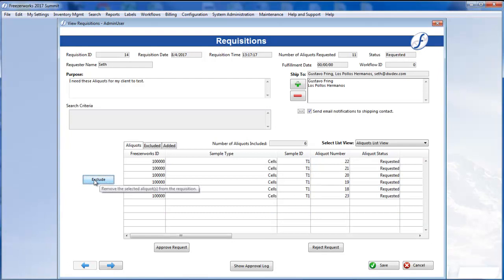If I want to add aliquots, I can do that as well. See Part 2 of this series for info about adding to requisitions. Now that the requisition is more to my liking, I'll click Approve Request.